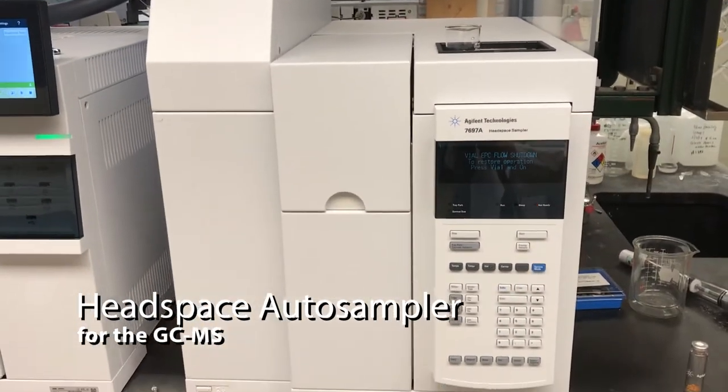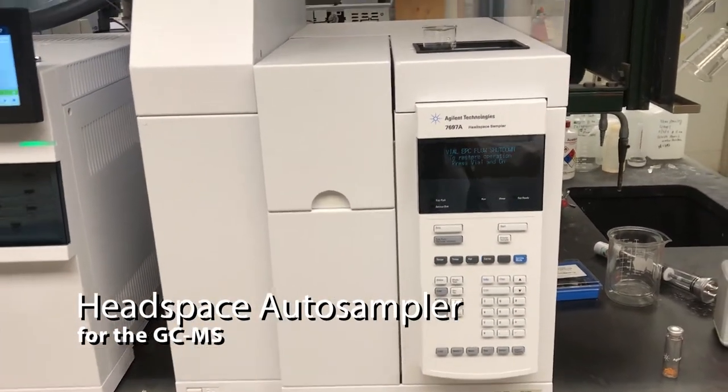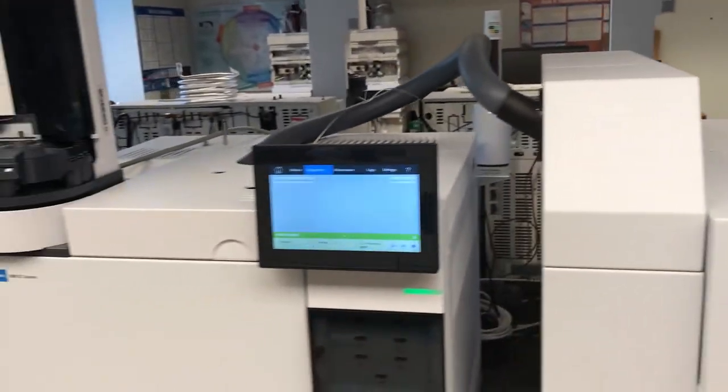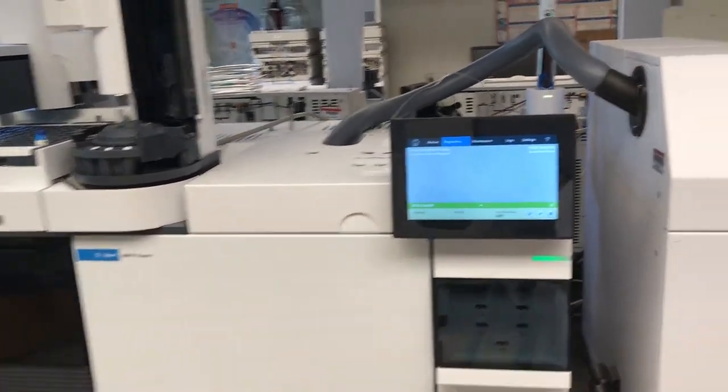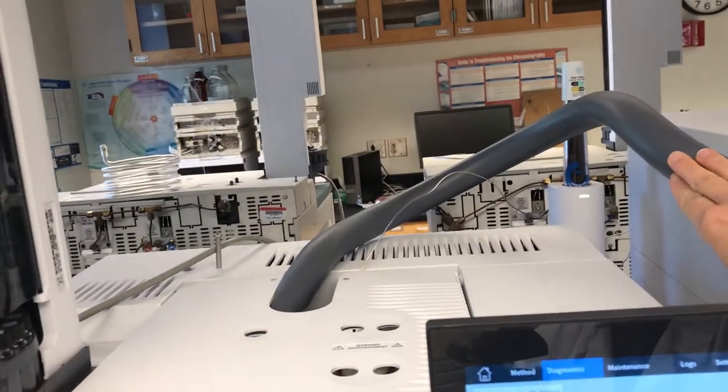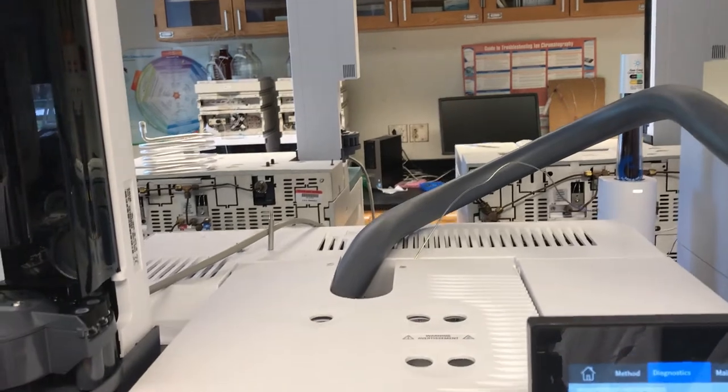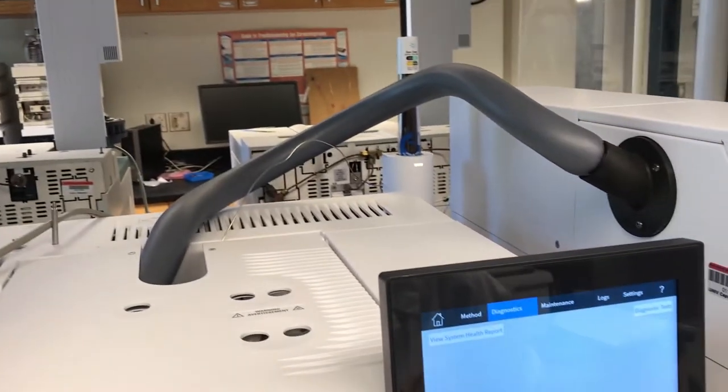So this is the headspace sampler. It's connected to the GC to the inlet using this transfer line. This transfer line is insulated in foam.